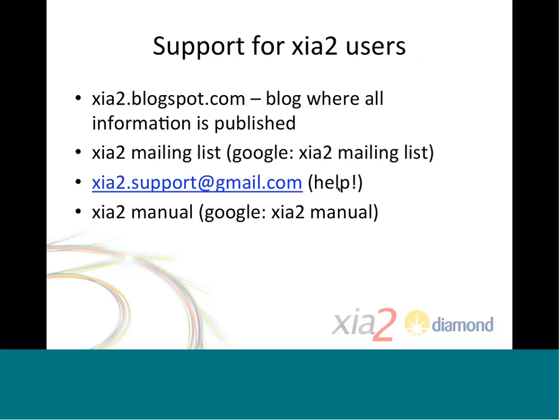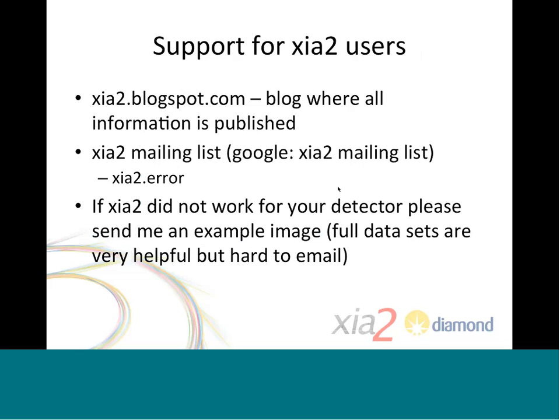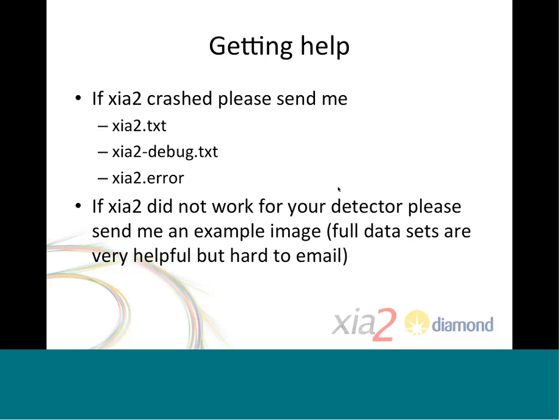If you find that XIA2 crashed, I will encourage you to contact the XIA2 support email address, which points to me, and attach some files. I'll discuss that in a minute. That's actually listed at the top of the XIA2 program output as well. There's also a XIA2 manual, which you'll find if you Google for XIA2 manual, although the design of the software is such that hopefully you won't really need a manual.